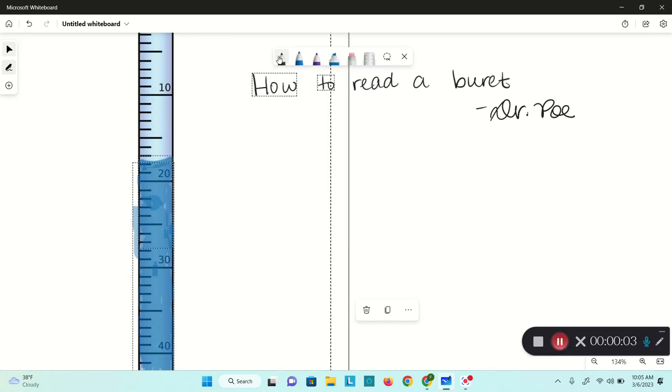Hi everyone. In this video, I want to show you how to read a burette.